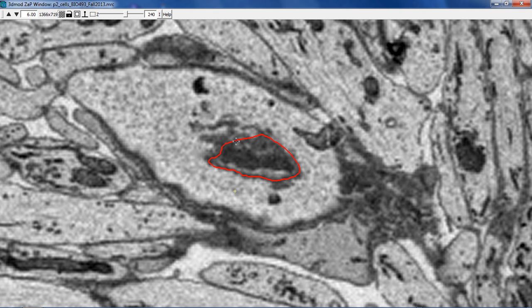So I'll do that. I'll click on the contour. You can see that it was selected because the green beginning and red end show up, and then the yellow circle shows us which point I selected. And I will hit E for smooth, and R for reduce.